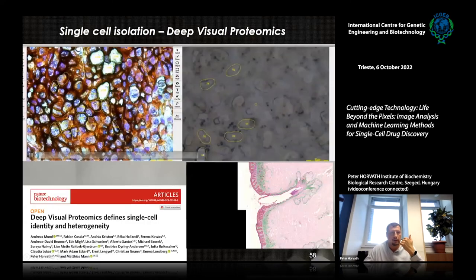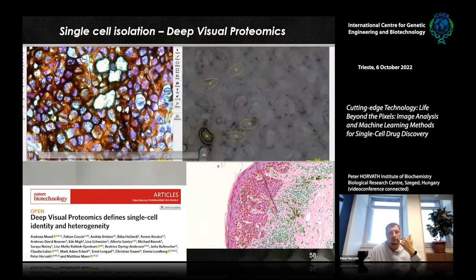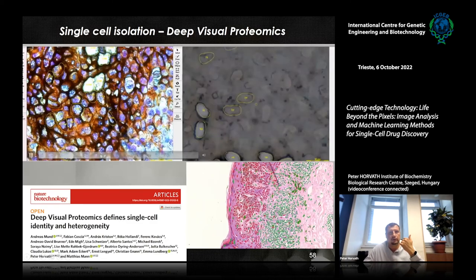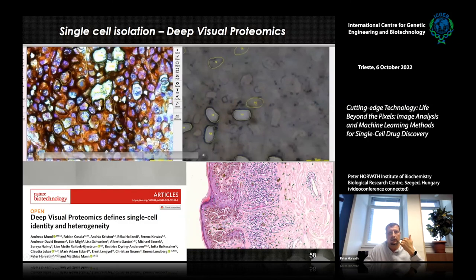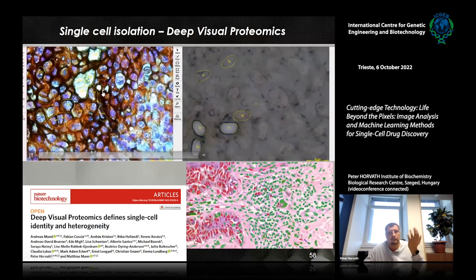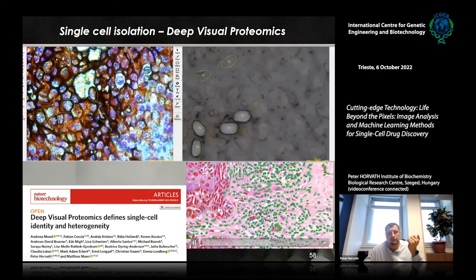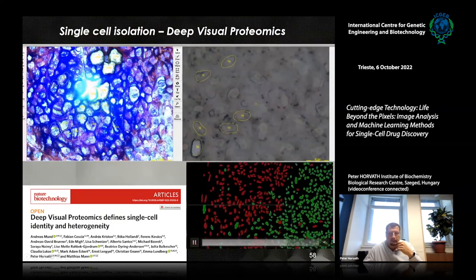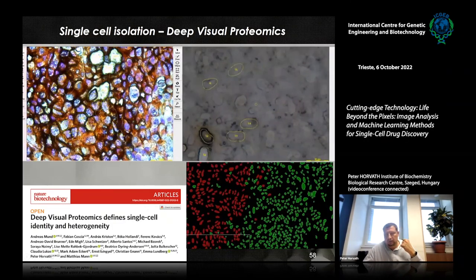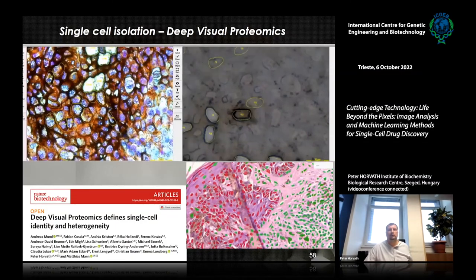And just to show you how it works, you can see here that contours are detected, the machine goes there, and when there is a flash, then it actually cuts the single cell out, and then it collects it to usually 384 well plates. Here you see on tissue cultures, cell cultures, and here it's a melanoma patient and their cancerous and non-cancerous cells. The paper just came out a few weeks ago in Nature Biotechnology, if you want to read more.